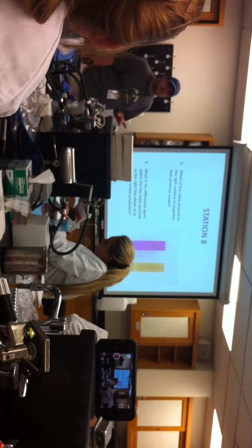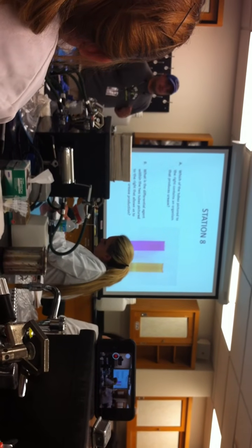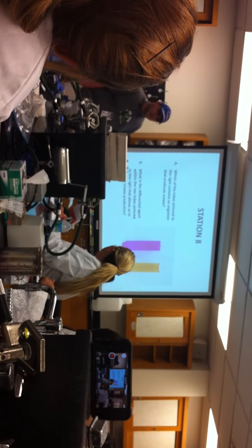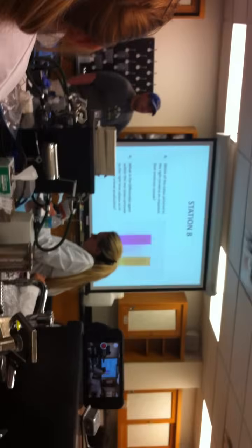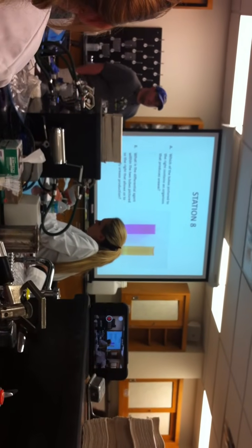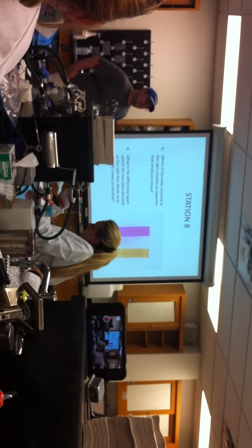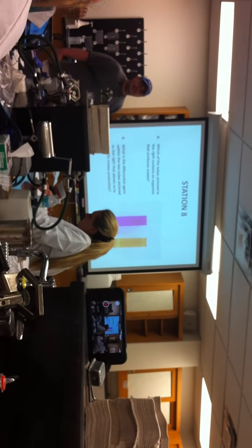What are you looking for? You're looking for urease. What enzyme? Urea. Urease. Okay, so if that's the enzyme you're looking for, well, what's in the tube? Urea. Okay, urease breaks down urea. So the tube has urea in it. Where does the urease come from? It's the bacteria. So you don't have to add it. It comes with the bacteria. It's packing a lunch with urease too. Okay, you don't have to add that.